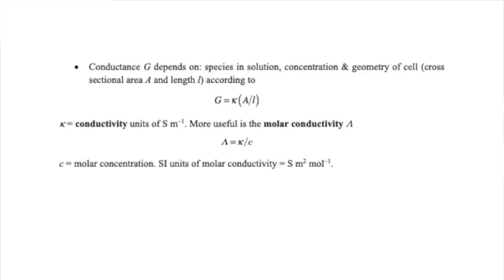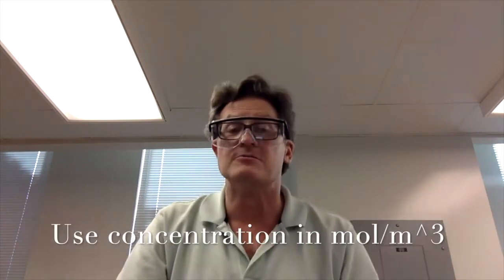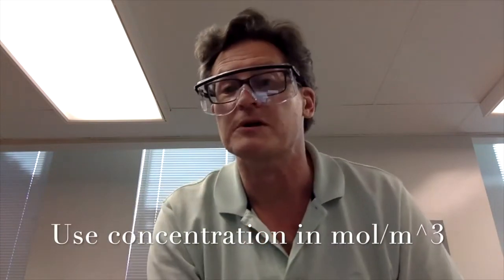All right, so we note that we've got our solutions and we need our conductivity meter. It is the conductivity that we're going to measure. And we're going to end up with that in units of, I'm going to give you that in SI units. So when I give you the table, it's going to be in Siemens, capital S, per meter, right? But note the concentrations I give you are in molar units, so you want to switch those over to moles per cubic meter, right?